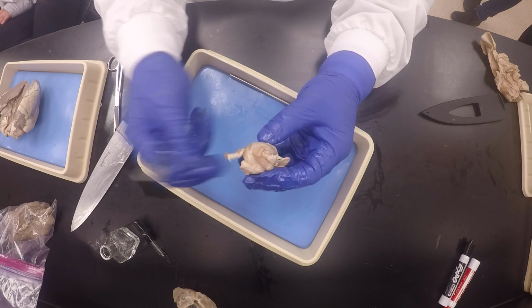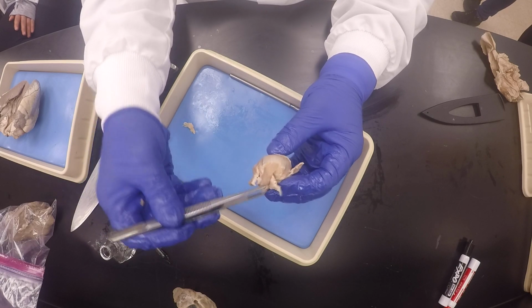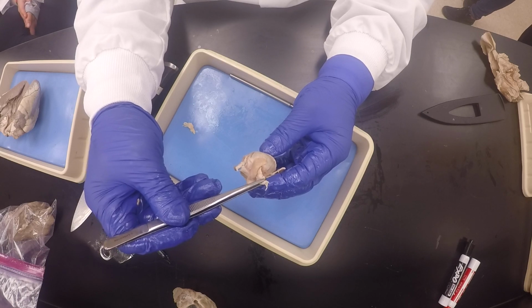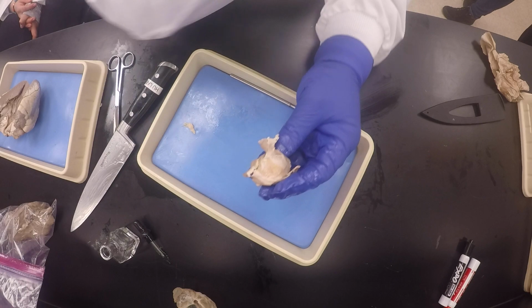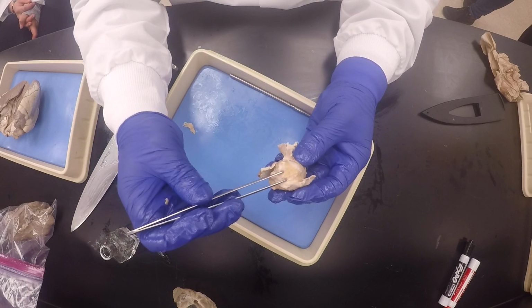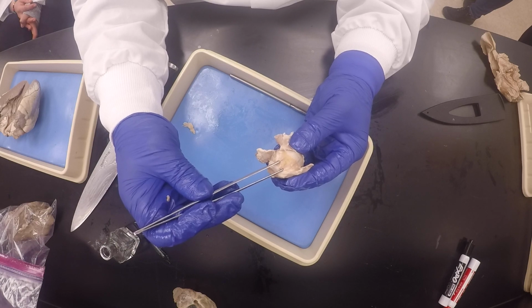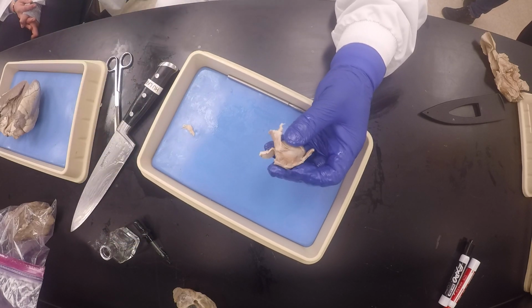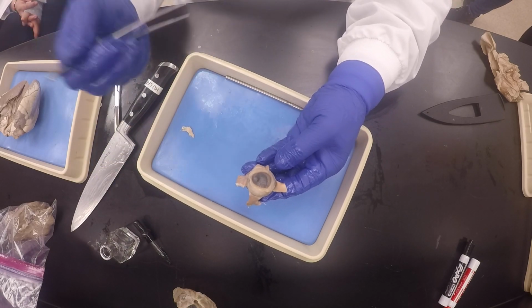And you will confirm it because you will see two muscles again, one at the compass point, which is the superior rectus, and one at the angle, which is the superior oblique. You understand? Then in the human, you would be done, and it's all on the board. But this is a ruminant, so you have this one, which is the retractor bulbi. You understand? Okay. So now, you guys, let's switch off the video.